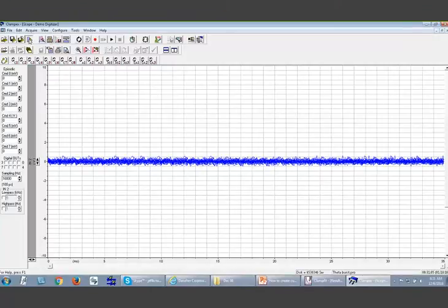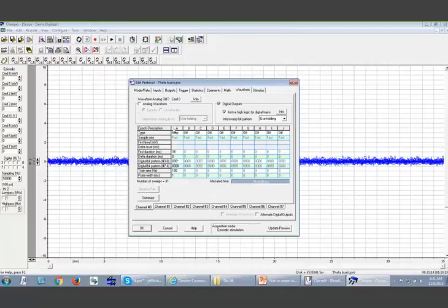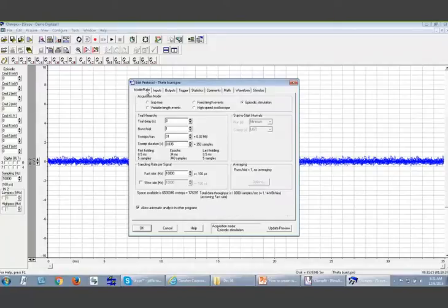So by doing this, setting up this protocol, user list, change the time between sweep start, and then use this one to set for the pulse. And for each epoch, you have the 4 pulses. Right, then the start to start interval will be overridden. And again, you need to set up here the sweep duration, and the sweep duration is 0.035 second here. All right, so I hope that you can play around yourself, that you should be able to figure out the theta burst stimulation.